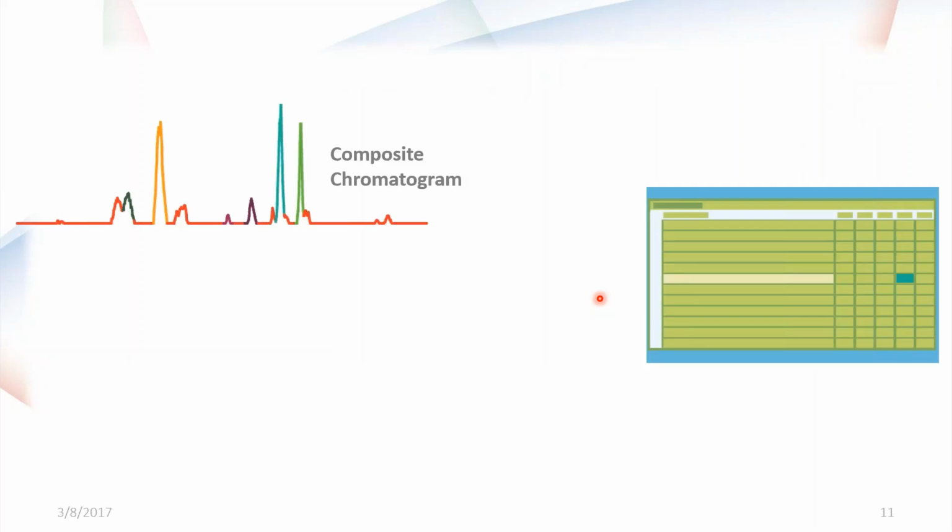Now, this is a graphical representation. I want to show the depth of this table. So it's more than just a simple Excel-like spreadsheet. It contains the same information that somebody would have if they were to put all this information into a spreadsheet. However, when you click on a row, you can see the chromatographic information behind that row under those conditions. Now, this is unique to ACDLabs.